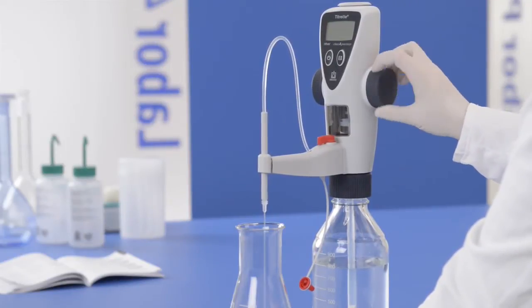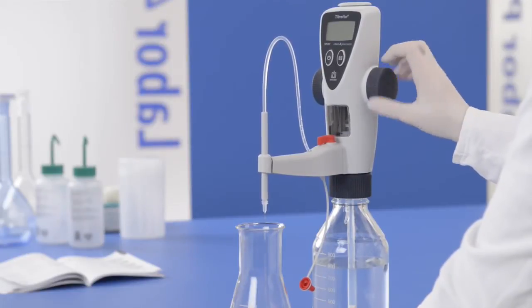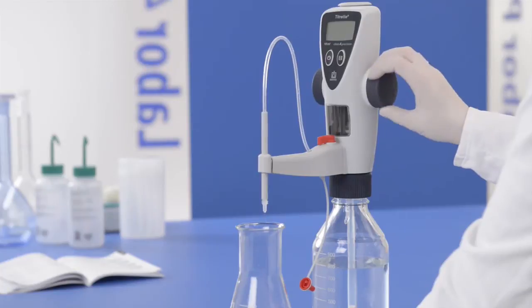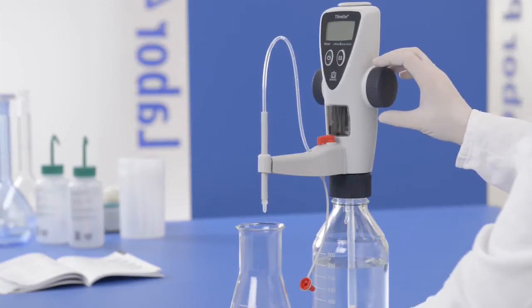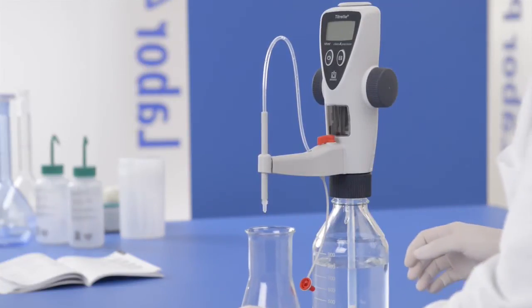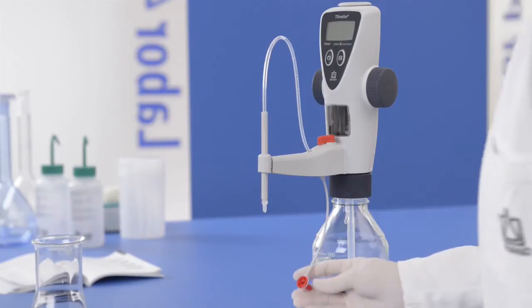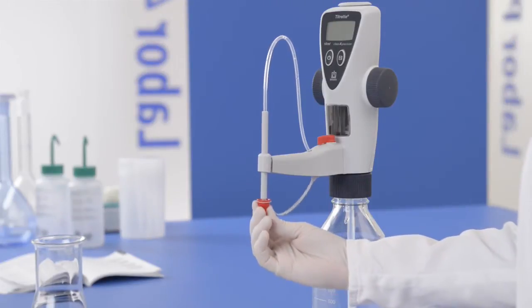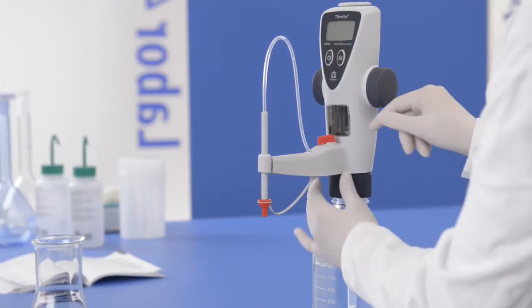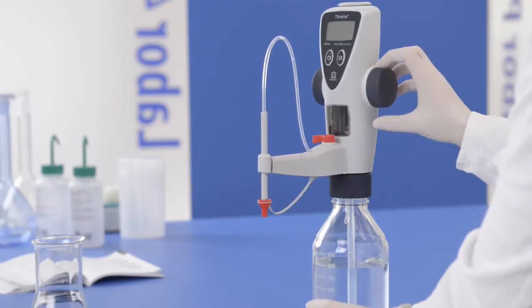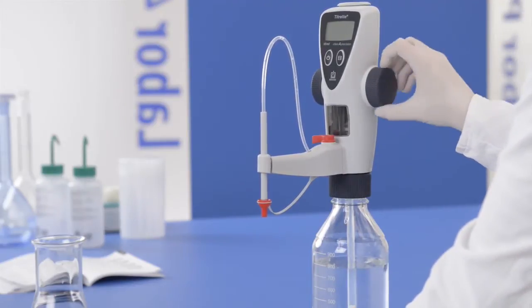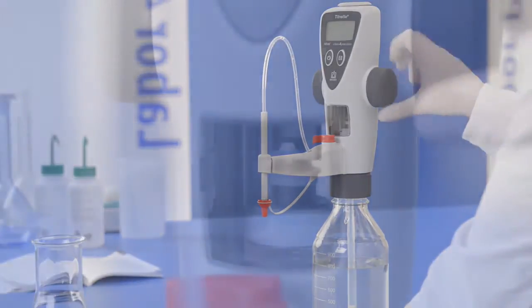Now set the valve to 'Recirculate' and check during filling whether there are air bubbles in the dispensing cylinder. If so, priming will be necessary.